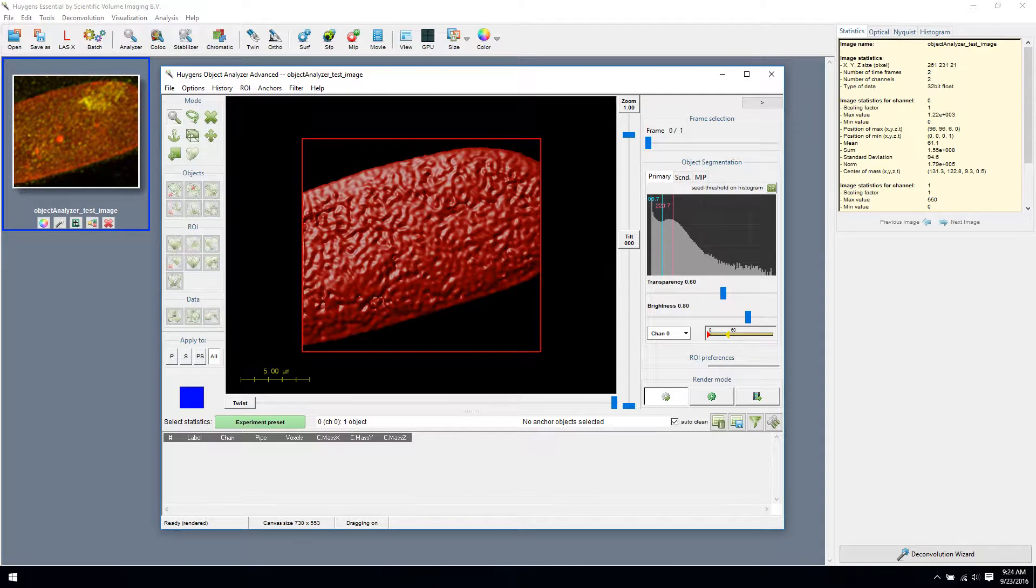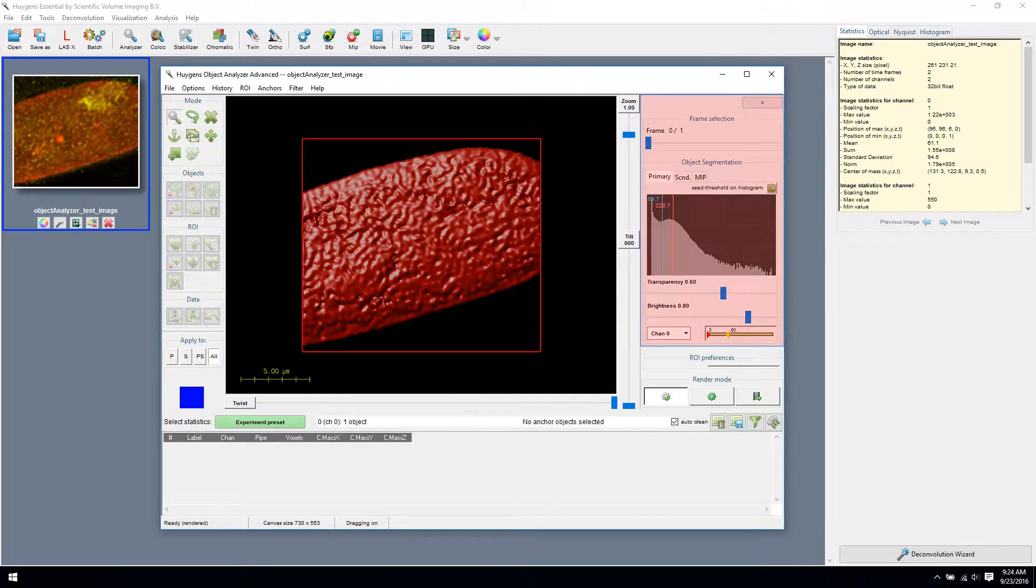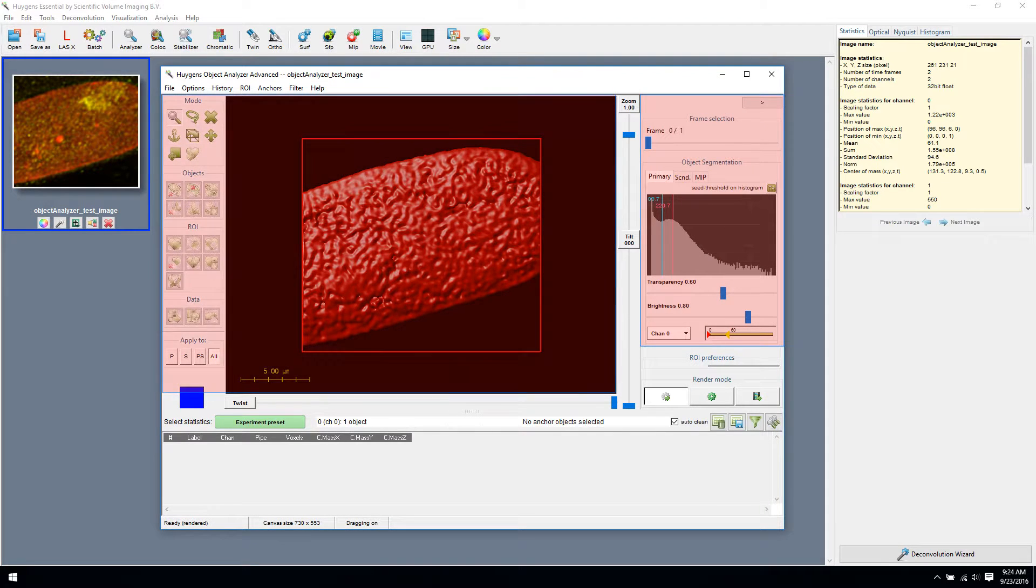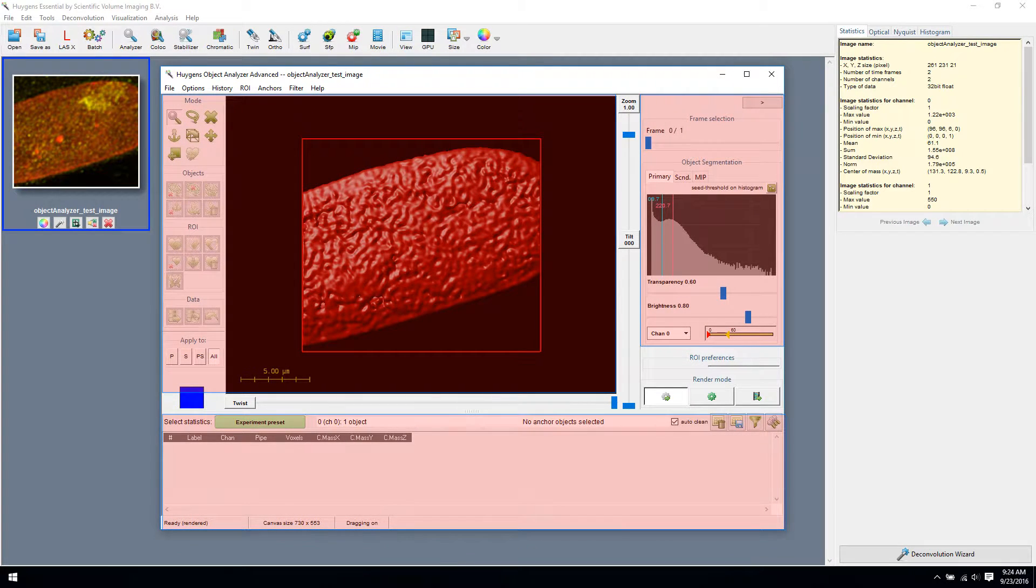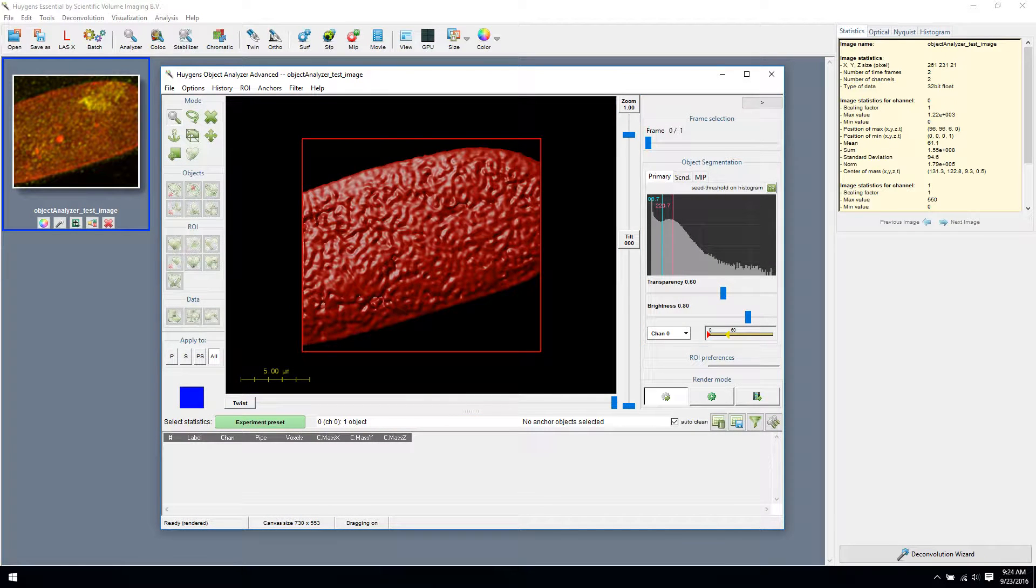Working with the Object Analyzer can be divided into three steps: Object Segmentation, Graphical Manipulation, and Object Analysis. Note that if you change something in one of the steps, you need to redo the following steps.